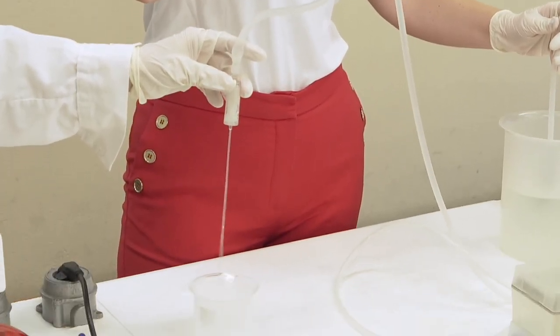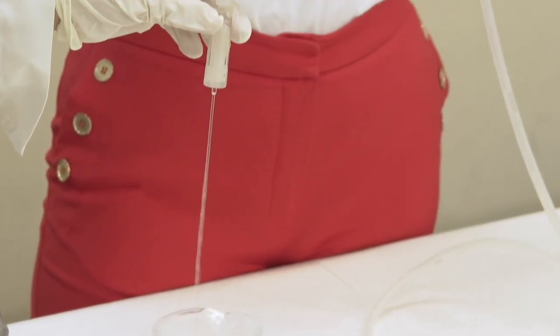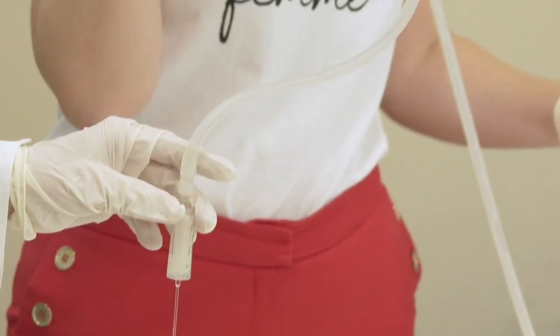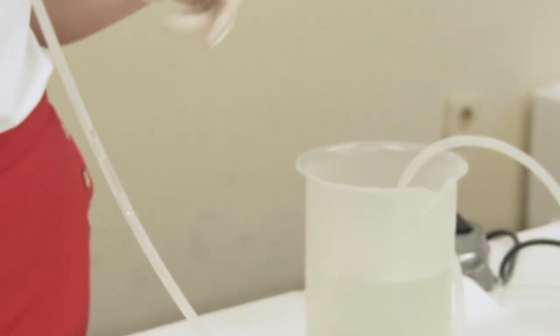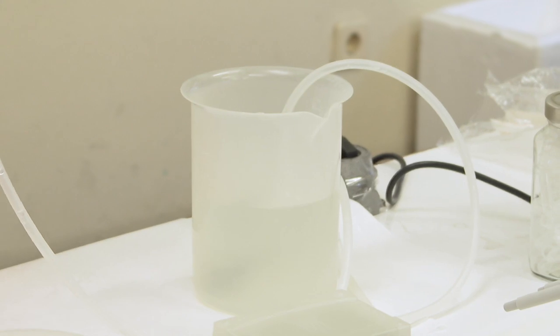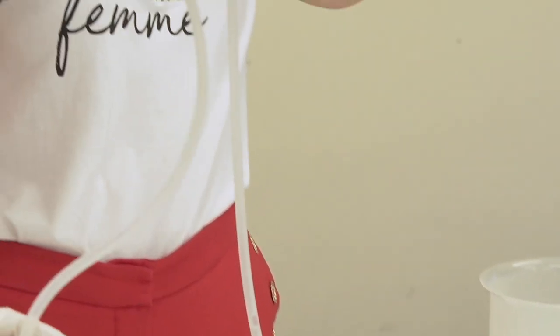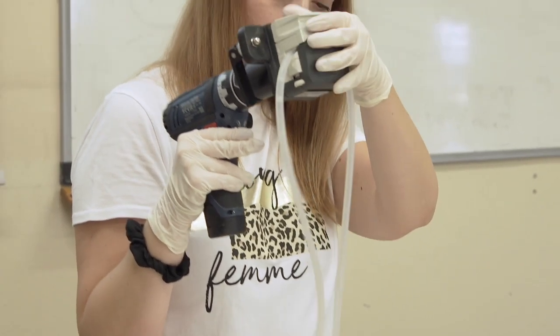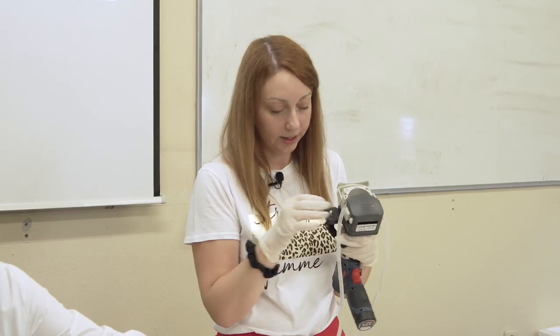When you finish filtering the volume of water that is needed, or maybe until the filter is clogged and no more volume can be filtered, just release the on-off button, and you have finished with the filtering and taking your sample from the field.